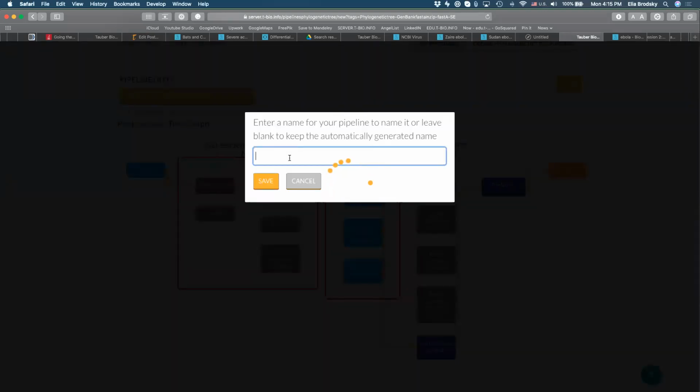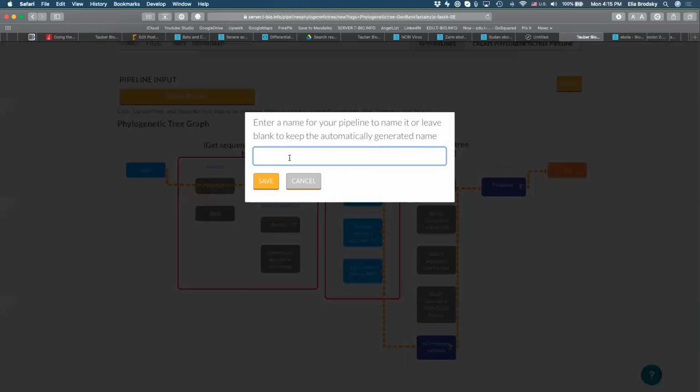And you will also see how in many different publications, this type of process is described. You don't just take a collection of files, do some kind of preliminary analysis of a phylogenetic tree, and assume that it represents the full truth. There are so many settings that you typically have in each step of the way that it's important to select those settings with understanding, and then evaluate the different settings, comparing them one to another, so that you can be more confident that the results of your analysis are reliable.